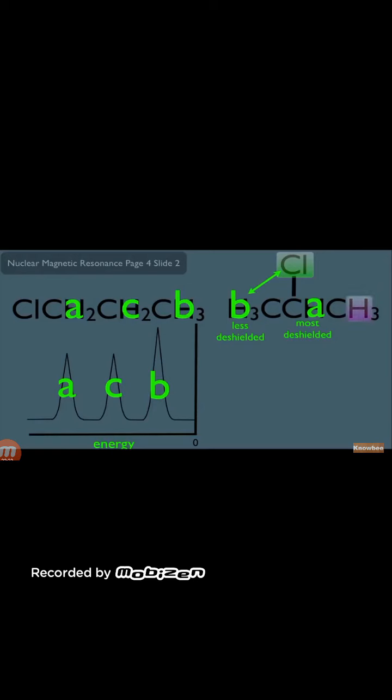But what about these hydrogens over here? Notice they are an equal distance to the Cl as the B-type hydrogens. So that means these hydrogens are roughly in the same electronic environment. The amount of energy to bring them into resonance would be the same, which means we can also call them therefore B-type hydrogens. They are literally equivalent. So what does that mean here? Again, what would the NMR spit out as its data? Since there are technically 2 types of hydrogens in this molecule, A and B, we should expect to only see 2 signals in his HNMR spectra.